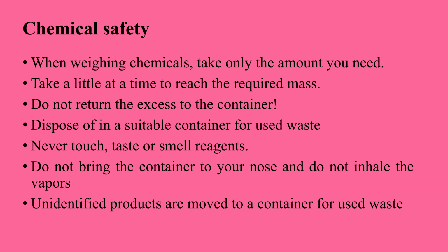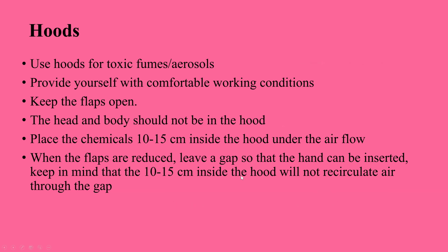It's not a good idea to use your eyes, nose or taste to evaluate what reagents are and how they smell, because it can lead to inhalation of these chemicals.